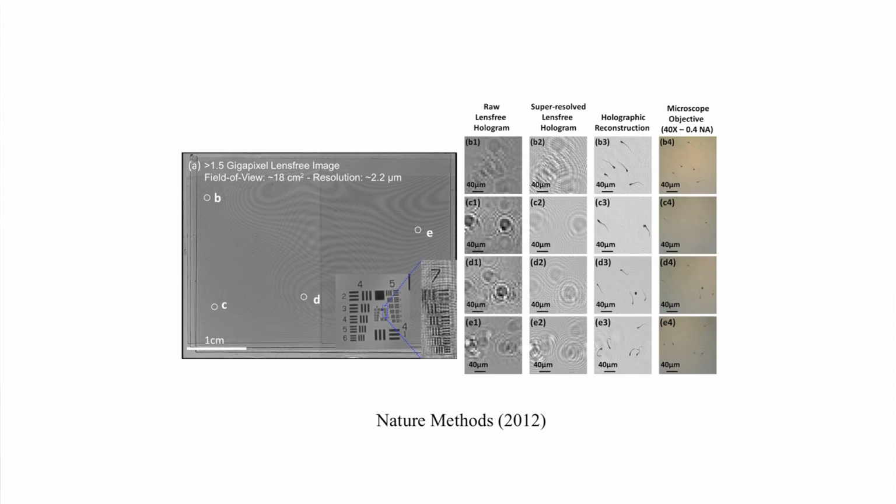If you don't want to stick to just the CMOS, then you can change the scale bar to even a centimeter. So if you're looking at CCD-based imagers, then you can even go for extreme field of view. In this case, you're looking at 1800 millimeters square. So it's really around 3 orders of magnitude wider, because this is essentially a very large format CCD. And these are some sperm samples being imaged, reconstructed based on their holograms.